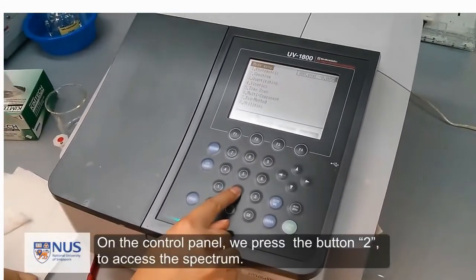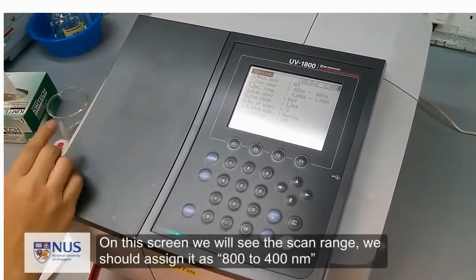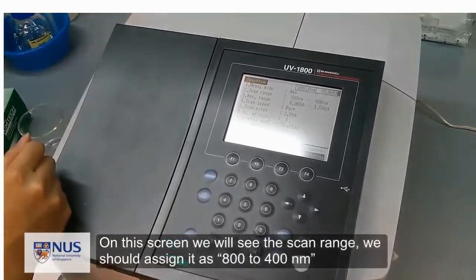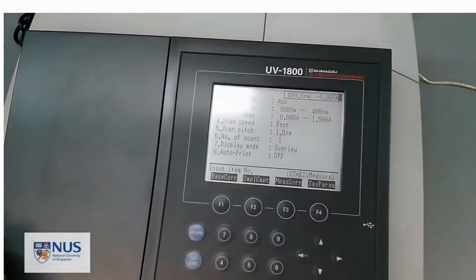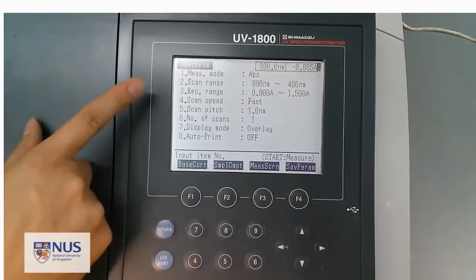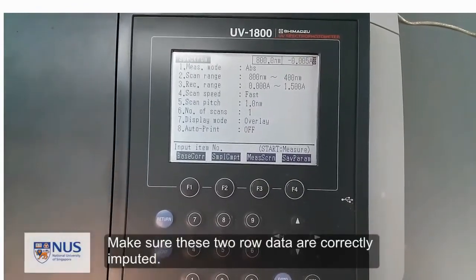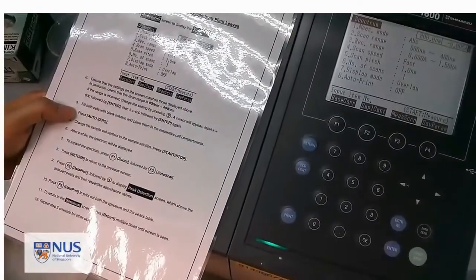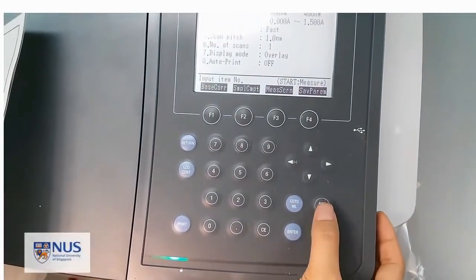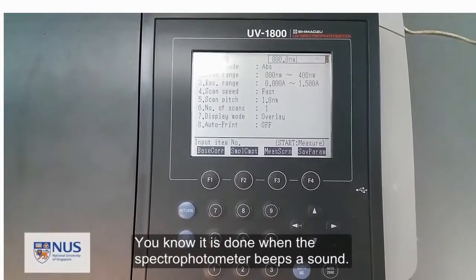So on the control panel, we press the button 2 to access the spectrum. On this screen, we will see the scan range, and we should assign it as 800 to 400 nanometers. The absorbance value we use is from 0 to 1.5. Make sure these two rows of data are correctly inputted. Following the manual, press Auto Zero. You know it is done when the spectrophotometer beeps.